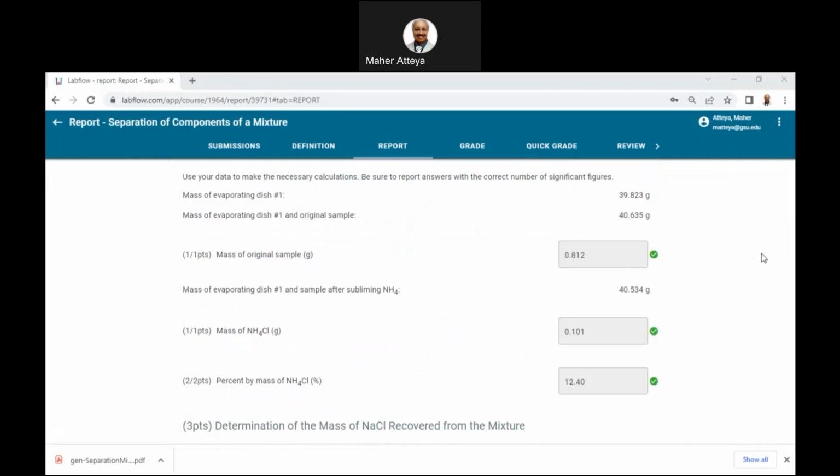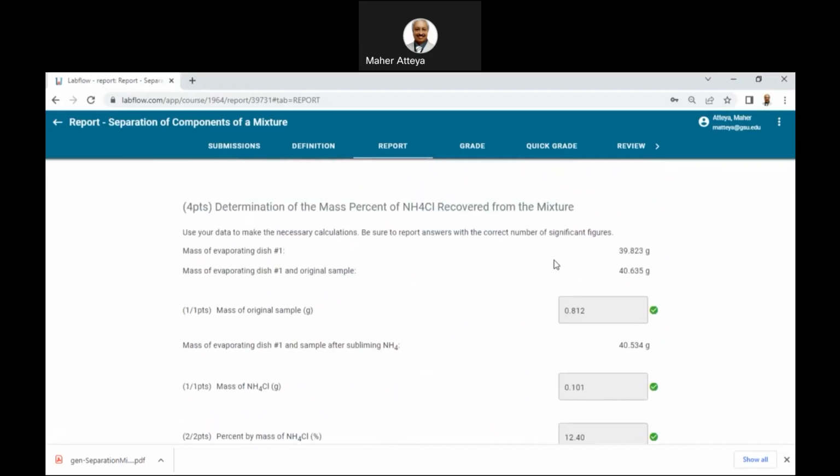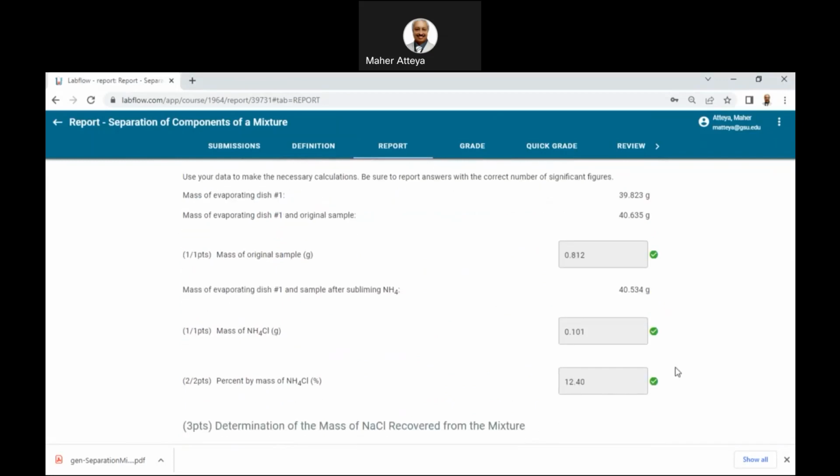So the data will start. Let me just take this one here. This is from here. So I'm collecting this as my data. This is the data. So here it is, that's the first one. Take this one here. Perfect data. I'll be using them for my lab report later on. I'll make the lab report and send it to you, but at least you know this is beautiful data. This is C here, and the data here.